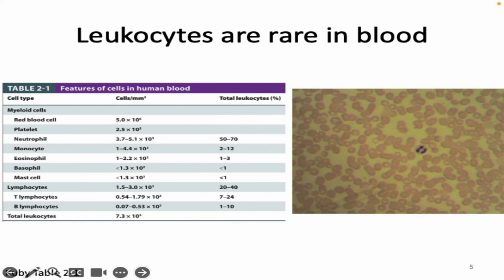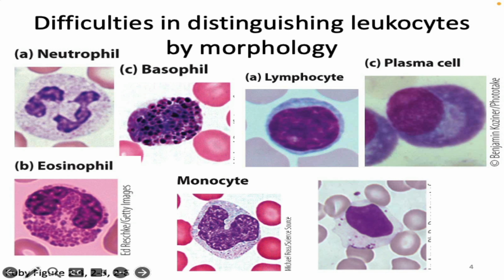In your answers to the Lab 1 questions, you gave me some suggestions of how you could make your data better, how you could deal with some of the difficulties here. What kind of things did you come up with that could help? Yeah, Jonah. Okay, so if we had a way to remove red blood cells, that can make our life a little easier. Sure. Yep. We could use a larger sample.